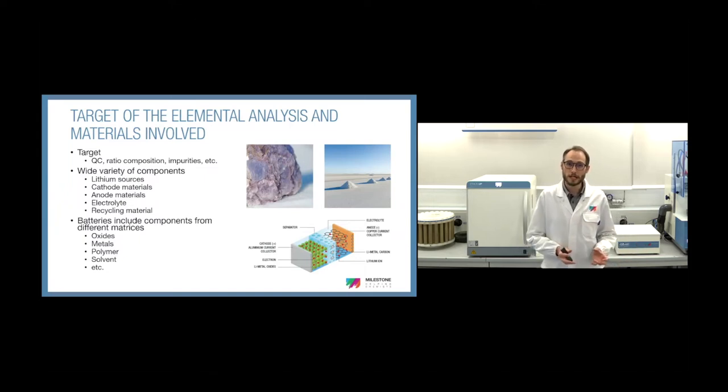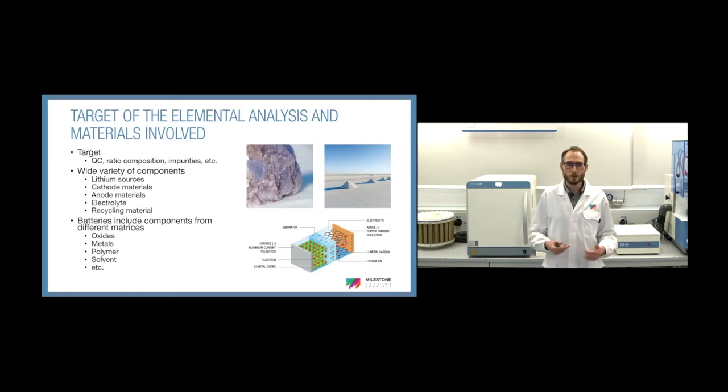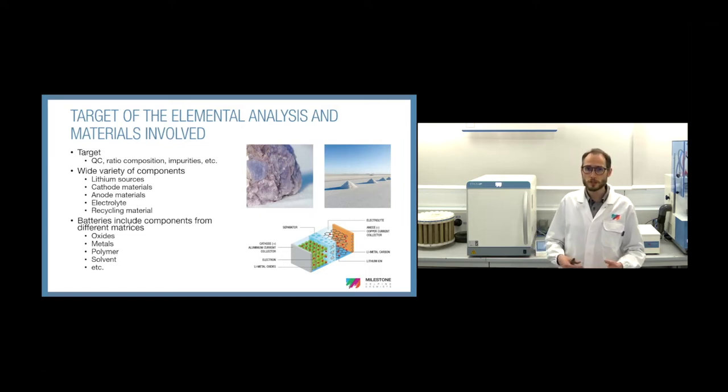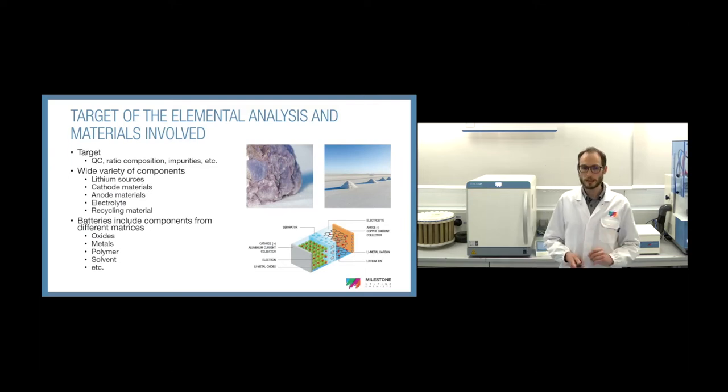But anyway, what is really interesting for the sample preparation is that there are many different kinds of samples. There is a big variety of components with different matrices. So we have to be aware that the methods for sample preparation could be different according to the materials that you have to prepare for the analysis. Batteries include components of oxides, metals, polymers, solvents, and all of them require a specific sample preparation method. But later I will give you more details about this.